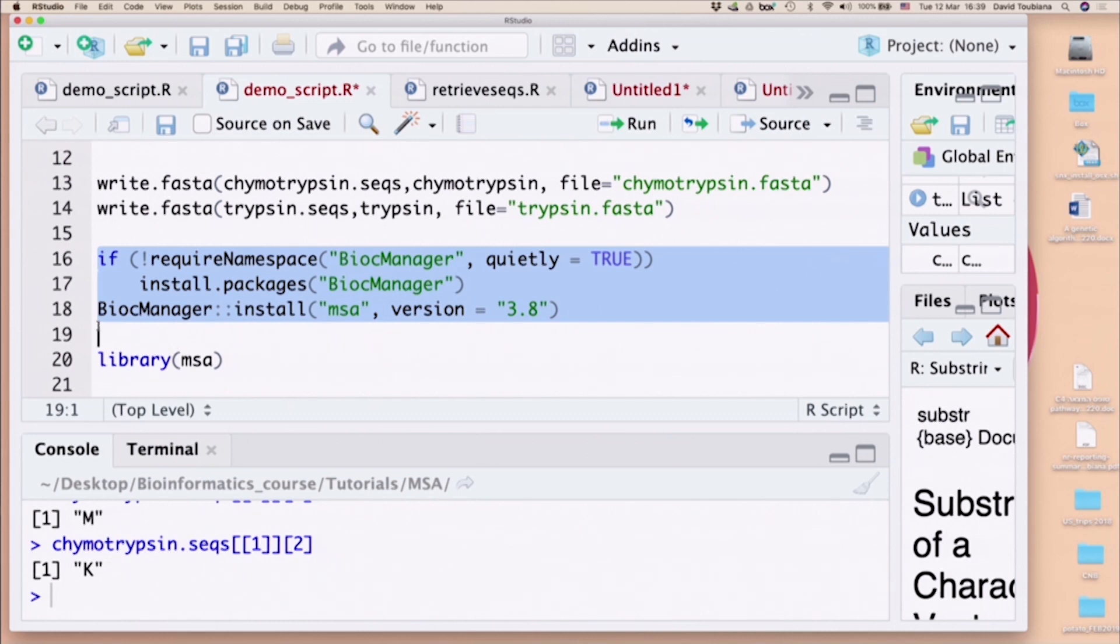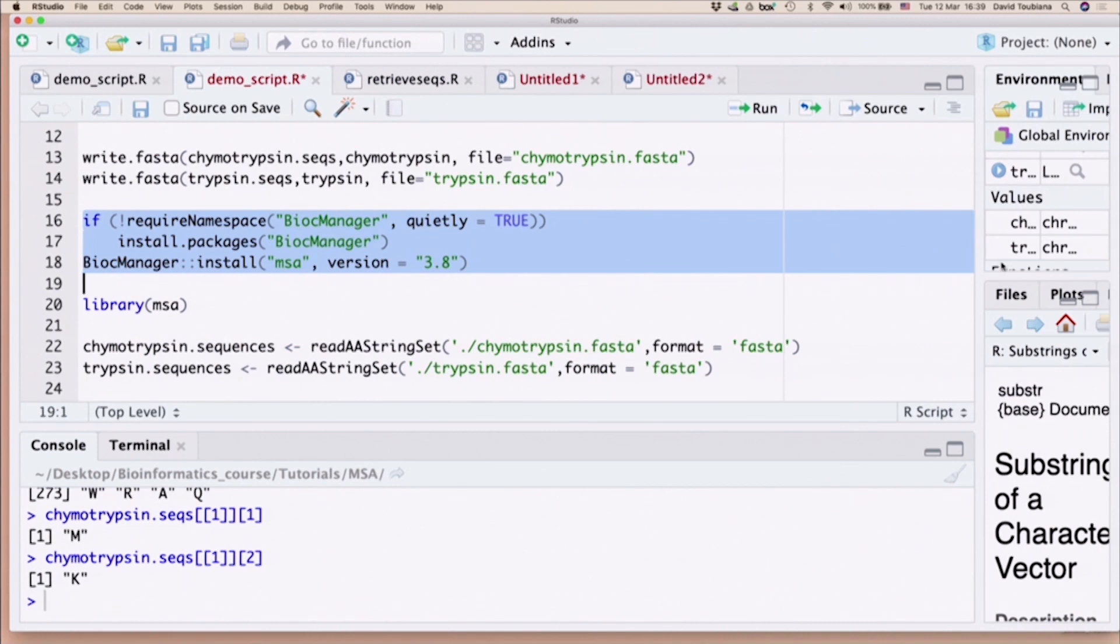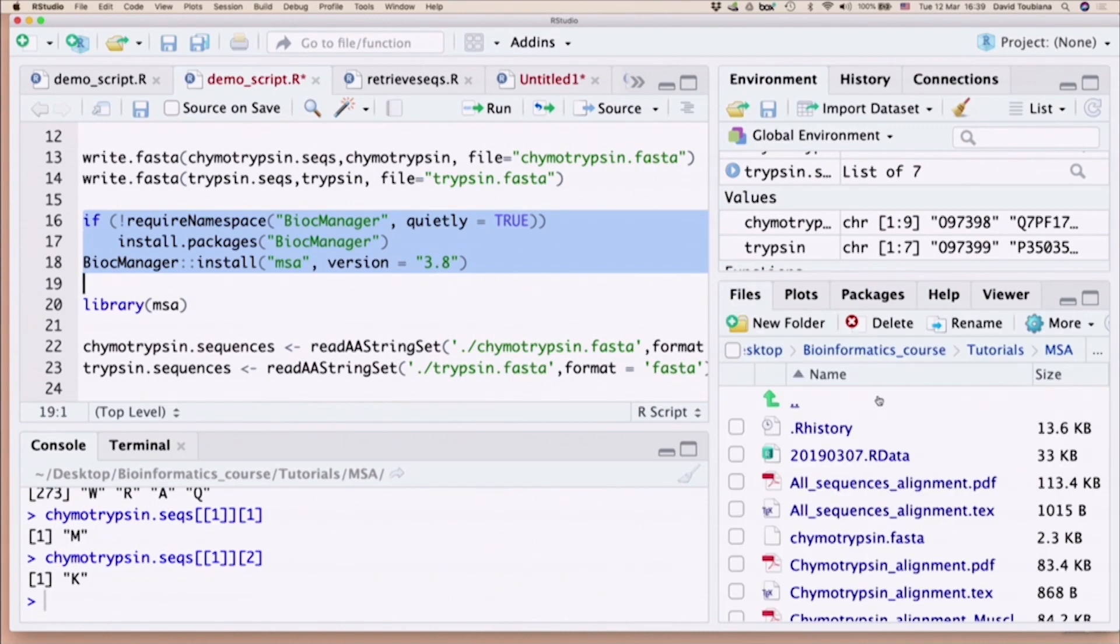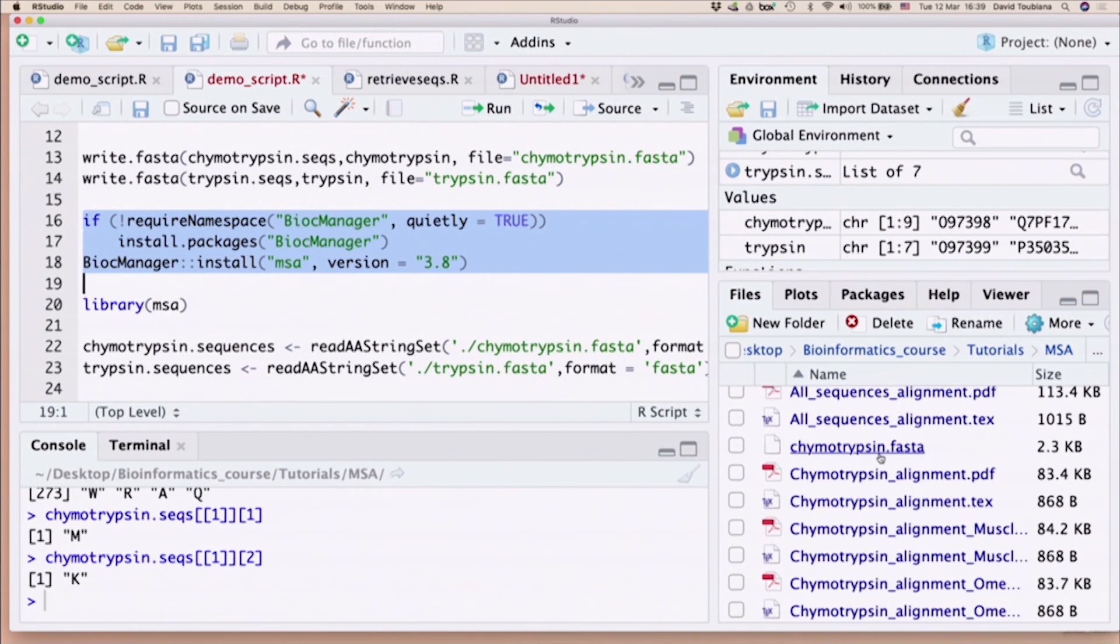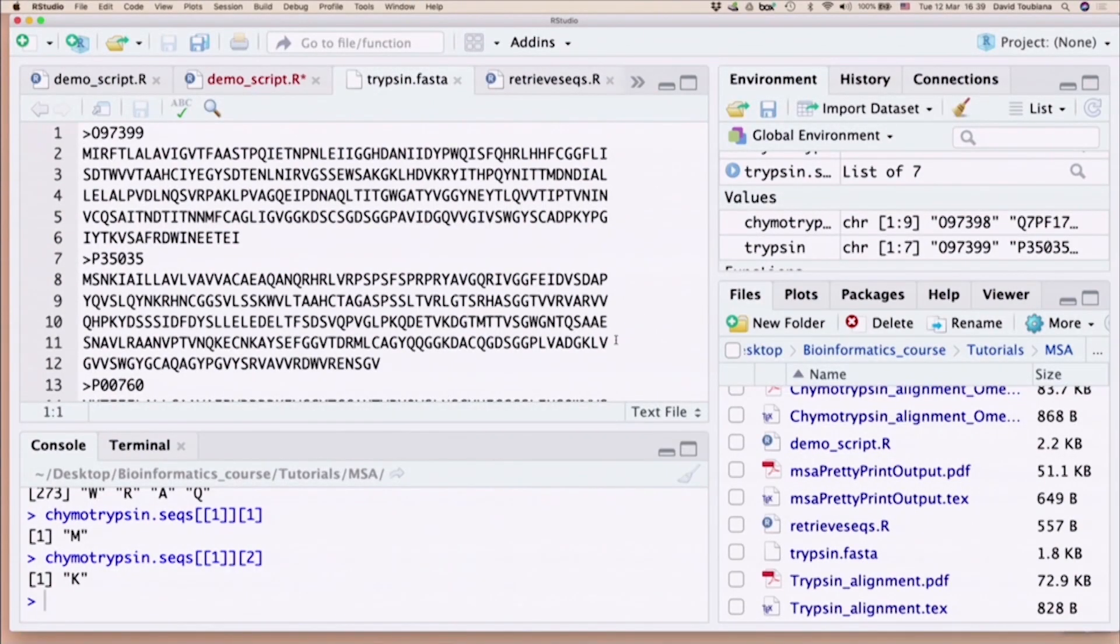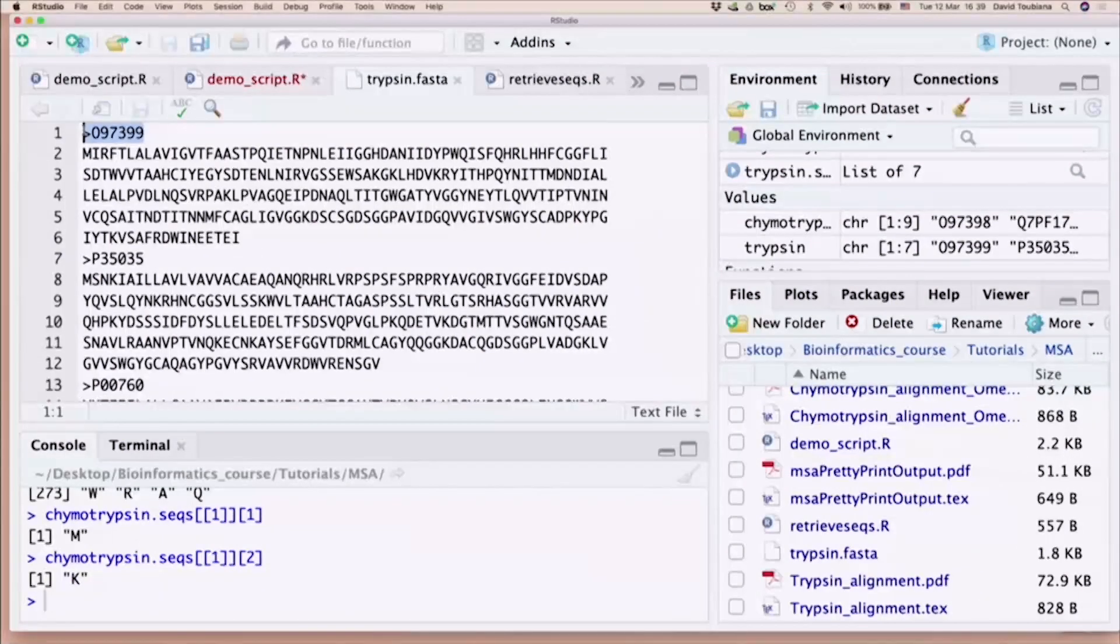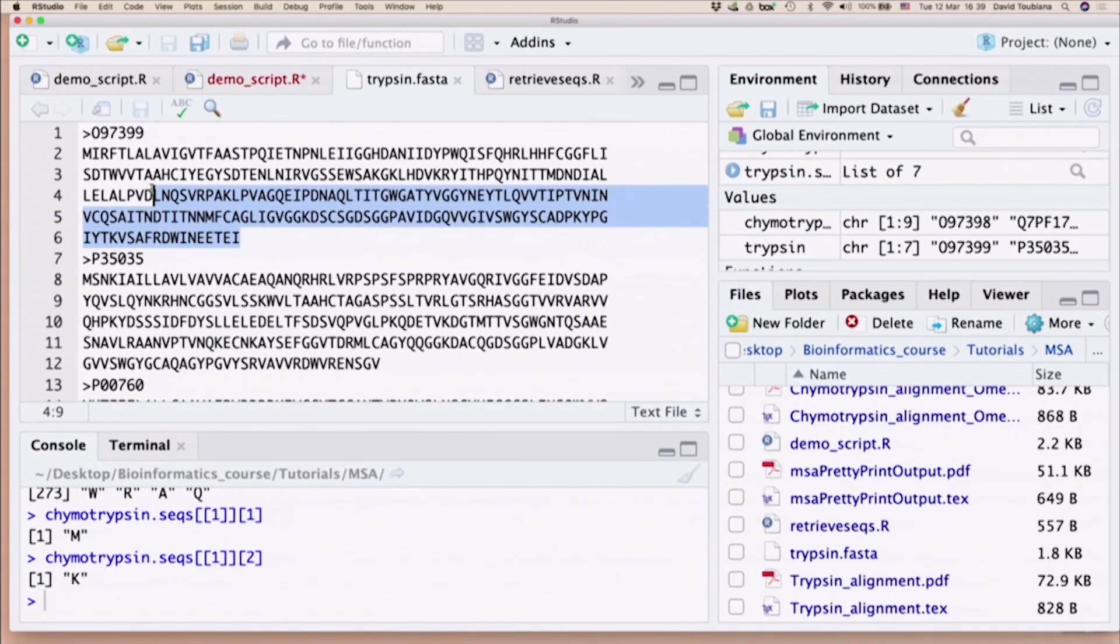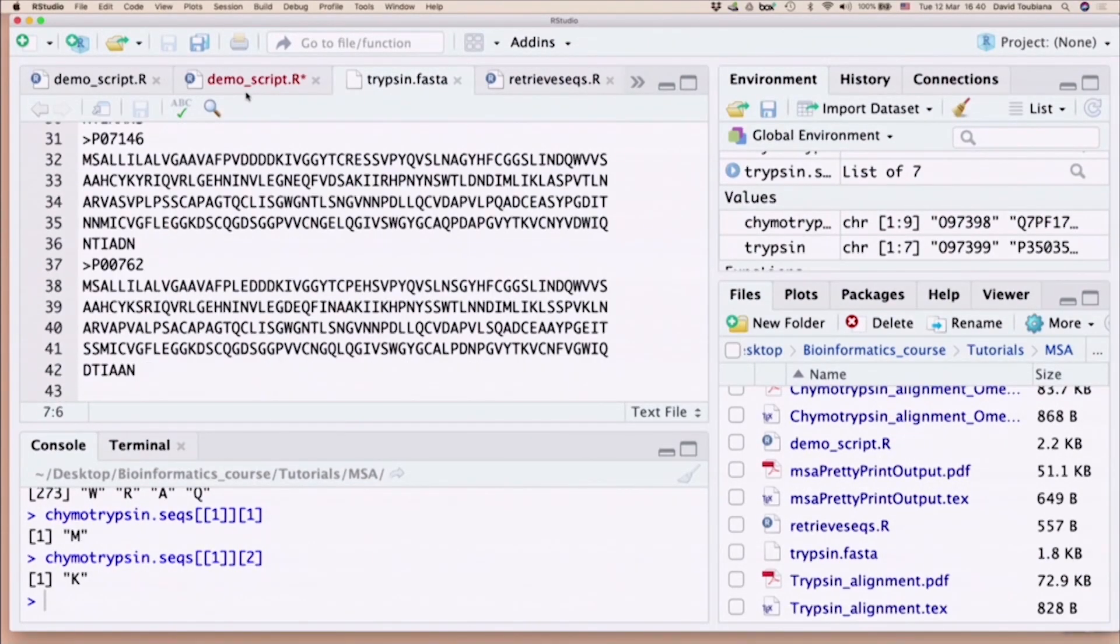You should be in the directory msa. So I write these two files. After I write these two files, if I look in the folder that I am in, I will have one file called chymotrypsin.fasta and one file called trypsin.fasta. I can just look at them. It will open in R. In a FASTA format, as we know, we have the name indicated by a greater than sign, and then we have the actual sequence, followed by another name, followed by the other sequence, and so on and so forth.